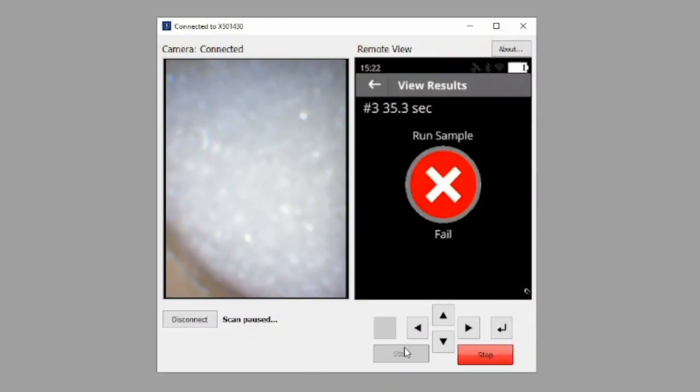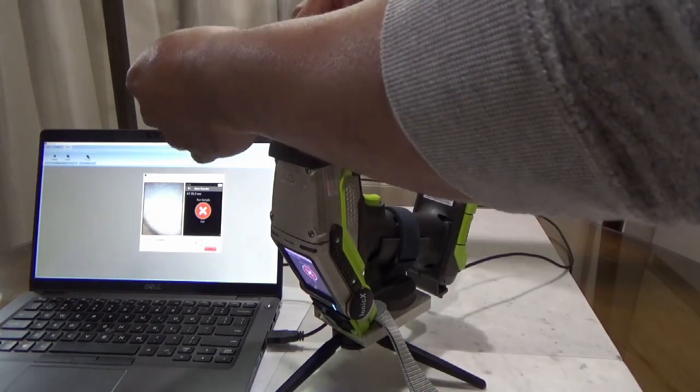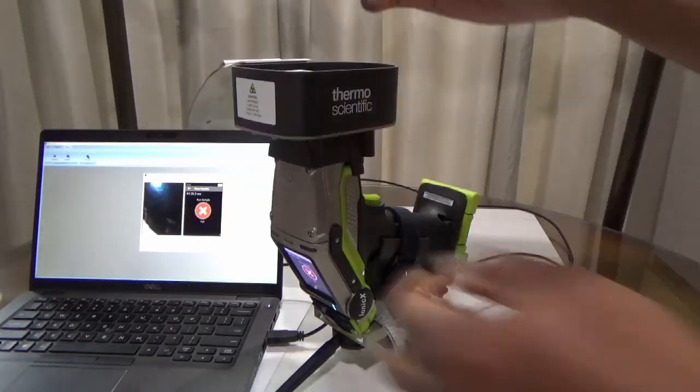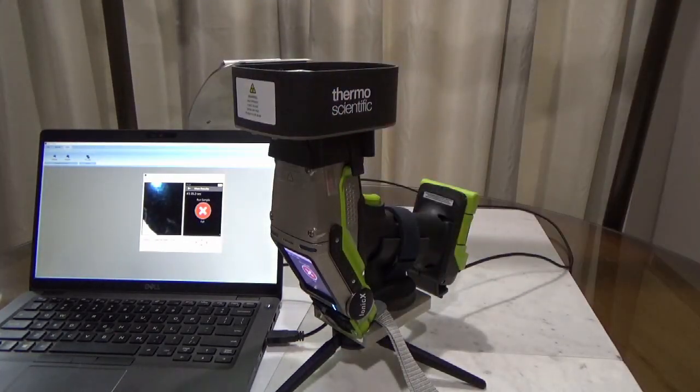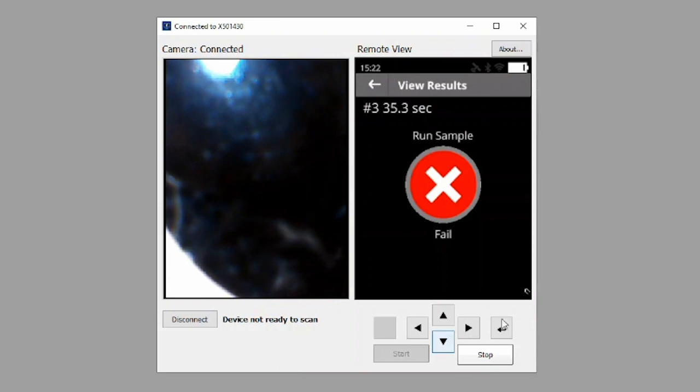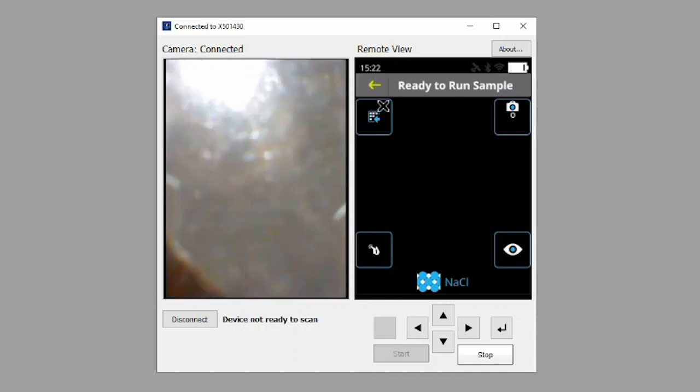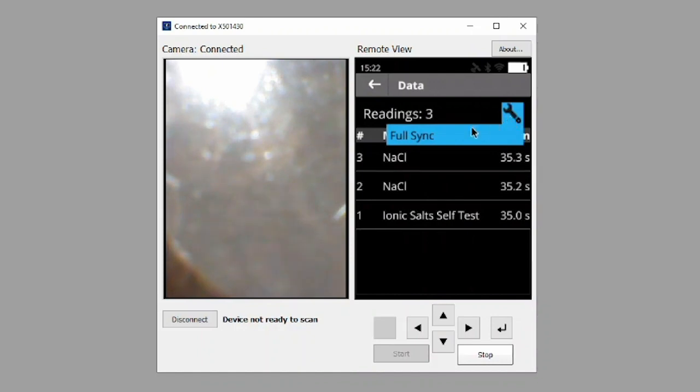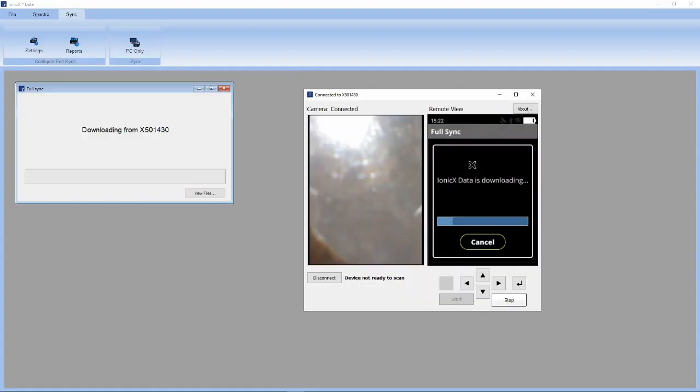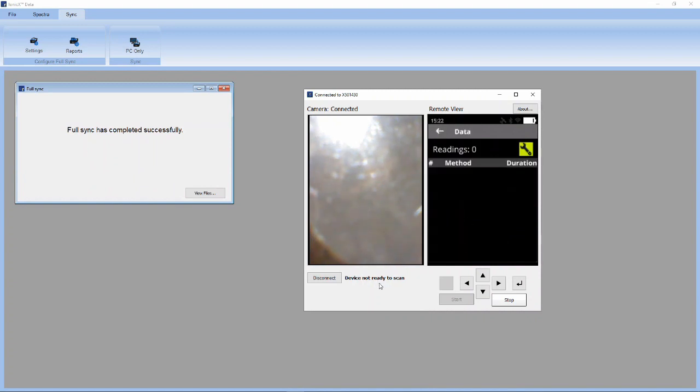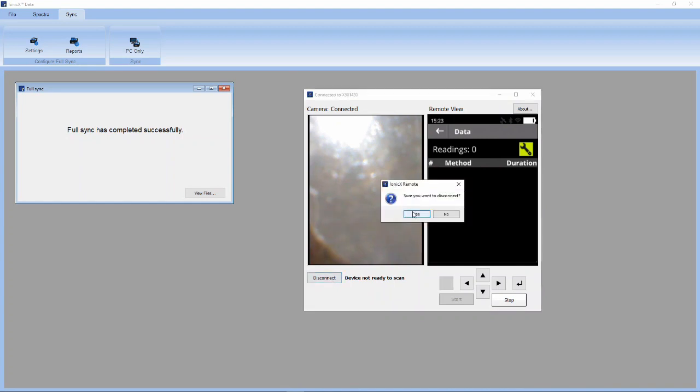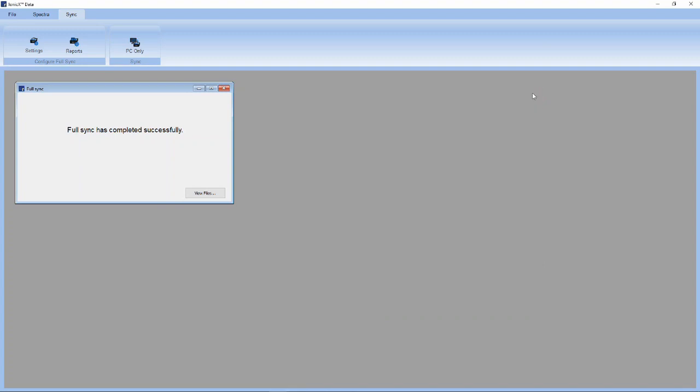Here we have a failing result. Doing a little investigation shows that this is not sodium chloride. Click the back arrow to return to the testing screen, and click it again to return to the main menu. Next, click on Data to review the results collected on the instrument so far. Click the wrench icon and select Full Sync to transfer data from the instrument to the archive location to review reports and also examine spectra using the Ionic X Data application. Once the sync is complete, the Ionic X Remote application may be disconnected and closed.